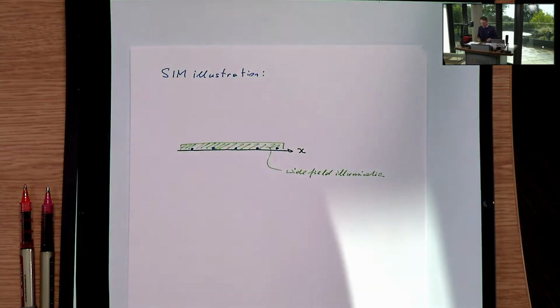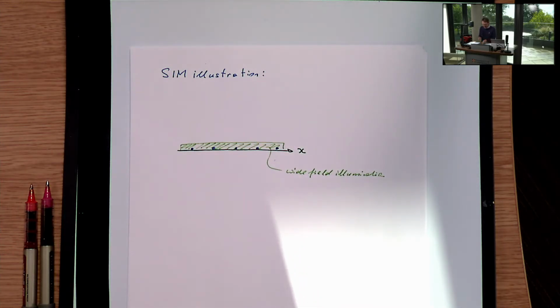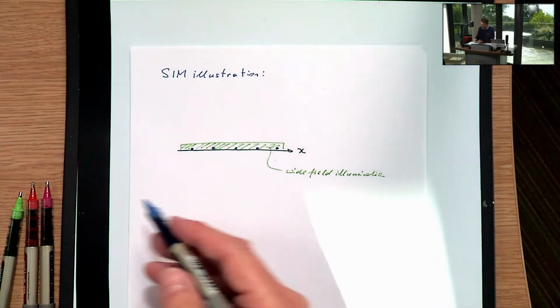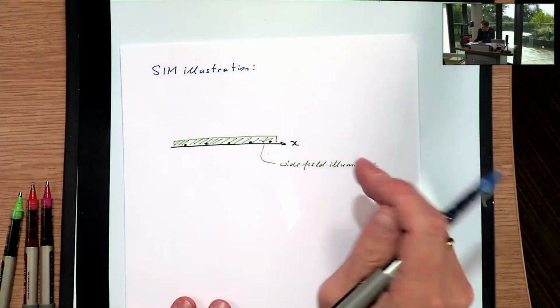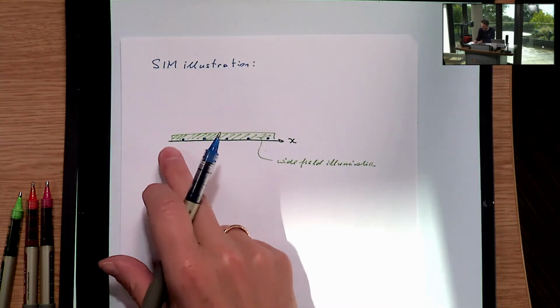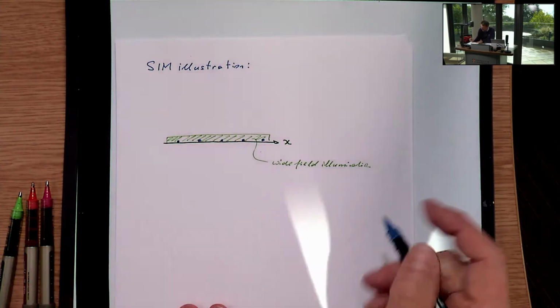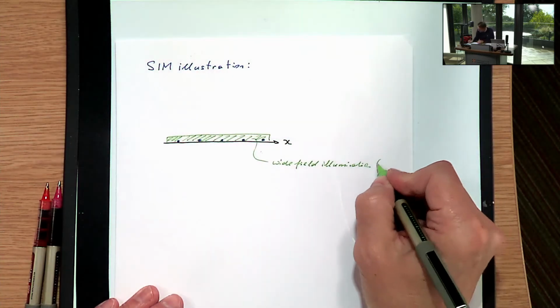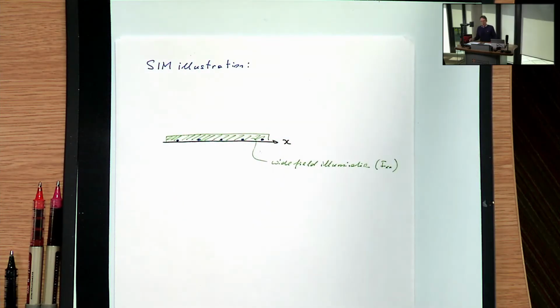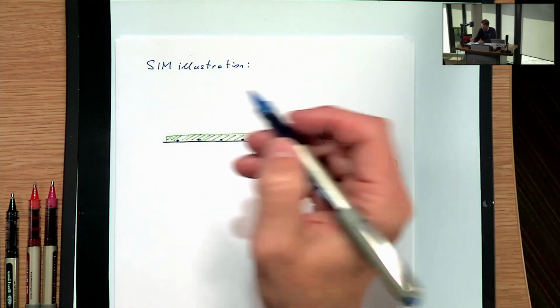So everything is illuminated homogeneously, and then what you get, this would be a standard microscope setup. So all these fluorophores now have the same excitation intensity. So we call this IEX. So the emission now will be the sum of all the PSFs from these individual fluorophores.